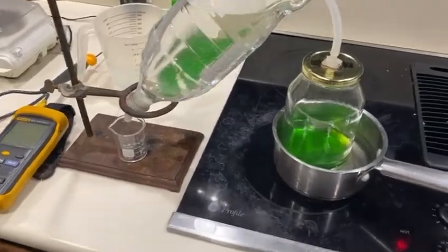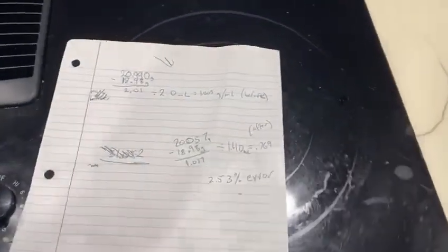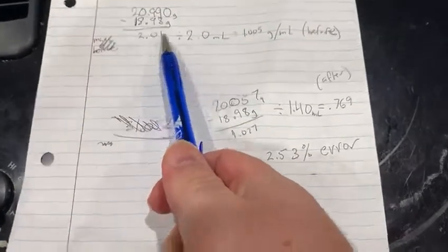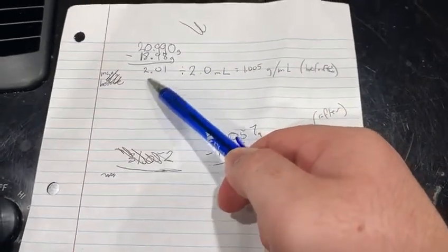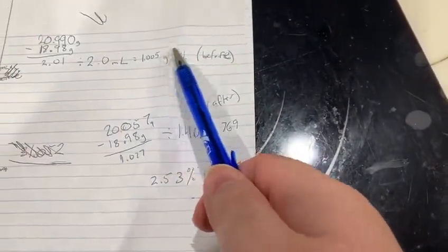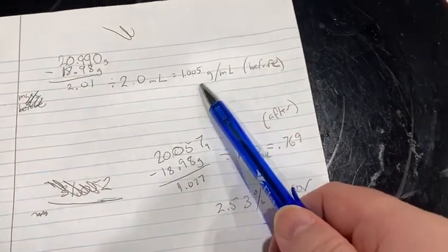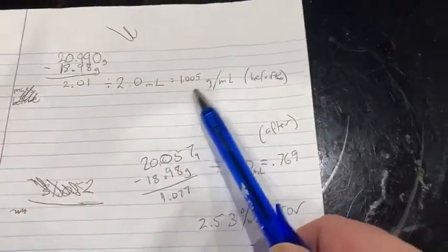Here we are after collecting enough product to be measured. I'm calculating the mass of the beverage beforehand — the graduated cylinder plus liquid, minus just the graduated cylinder, to get the mass of the liquid, divided by the volume of the liquid. That gives us the density before distillation. It's just above the density of water, which makes sense: even though the ethanol in there is only 14%, ethanol is actually less dense.